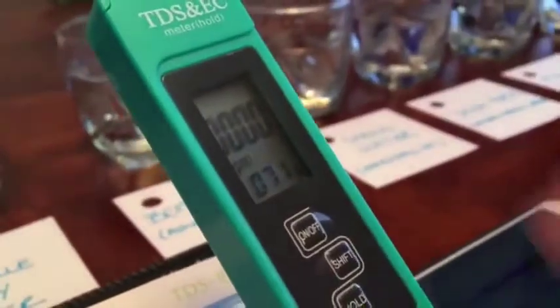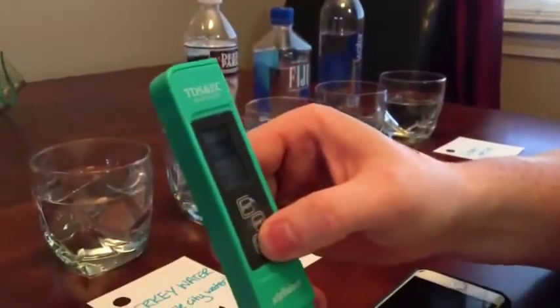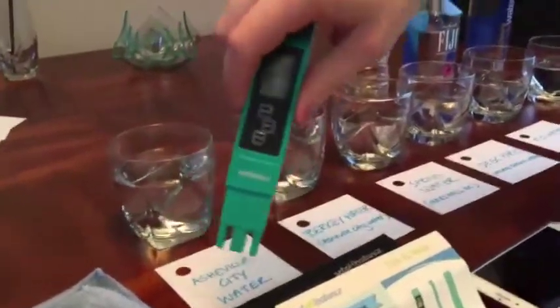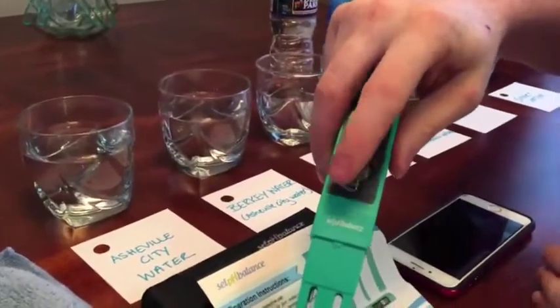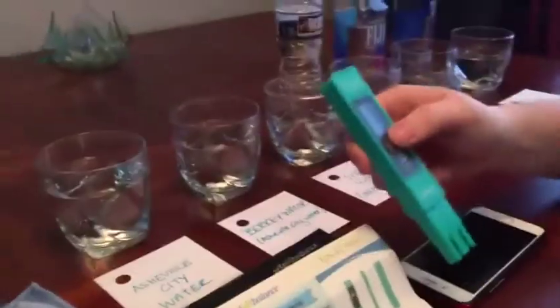Shift again gives you conductivity in Celsius, and shift once more brings you back to total dissolved solids in Fahrenheit. When measuring, the hold button locks in your reading so it won't disappear when you pull the meter out — very useful if you're reaching into a barrel or a well. Once you believe you have the reading, hit hold, pull it out, and you can see exactly what you measured.